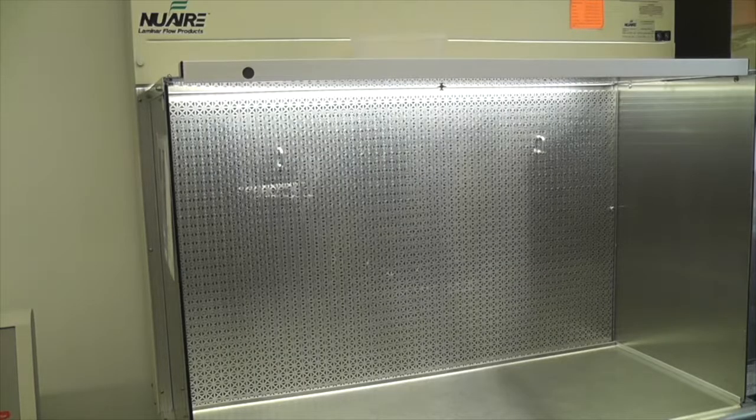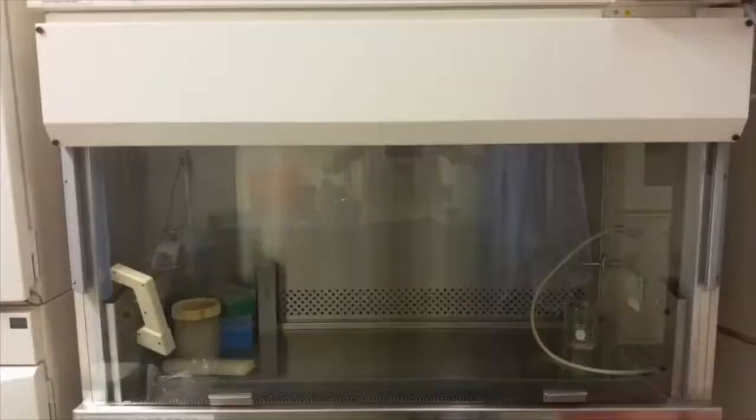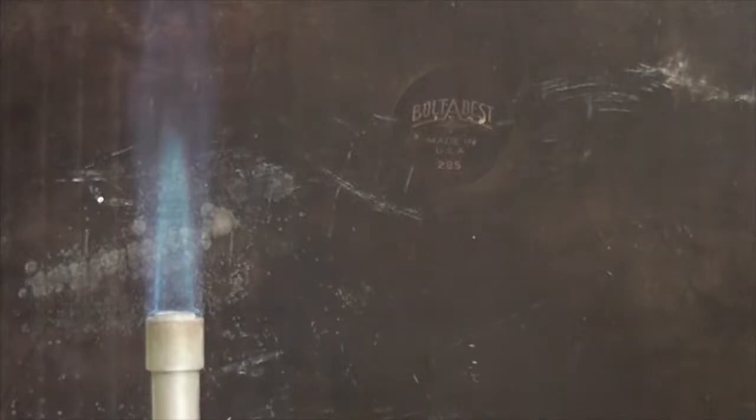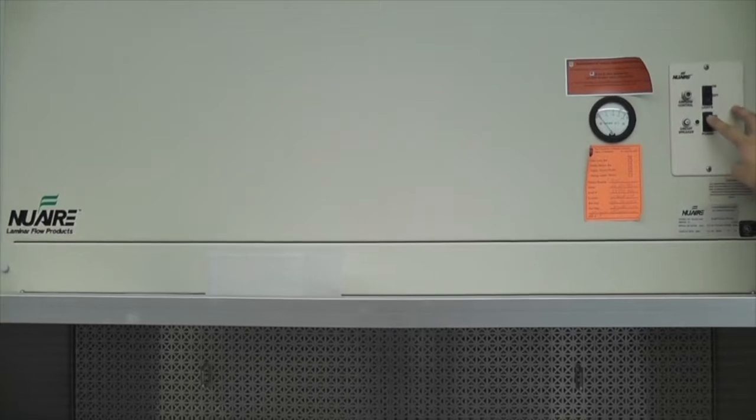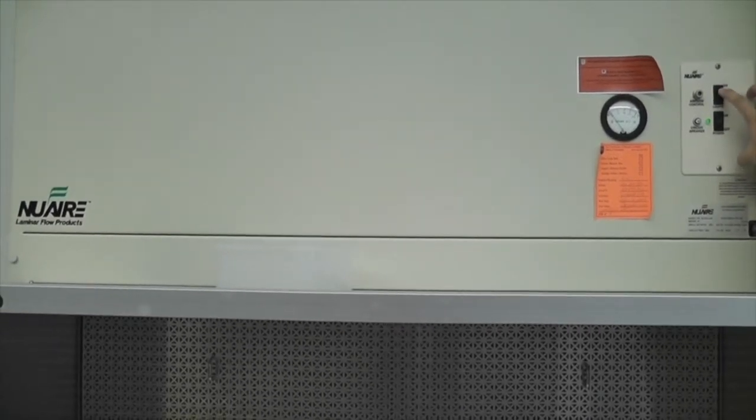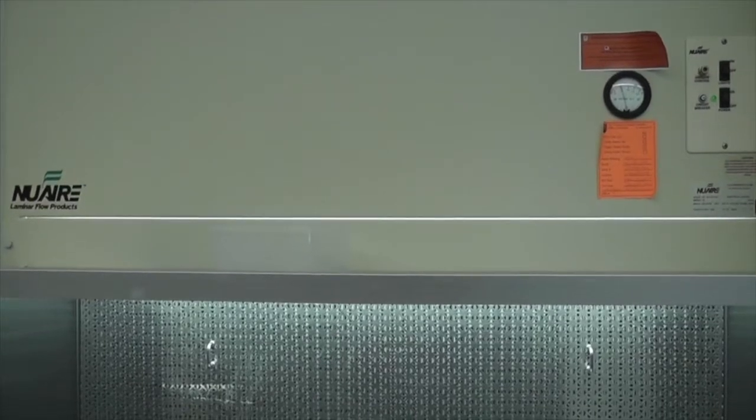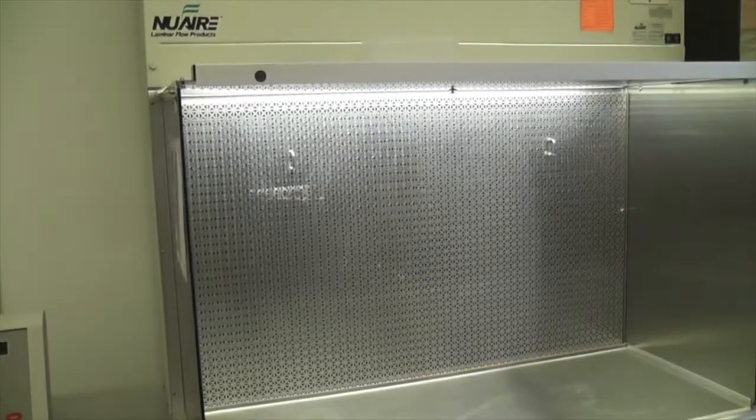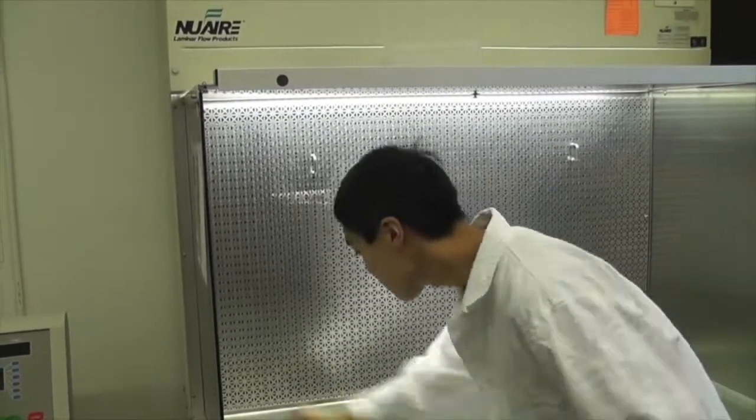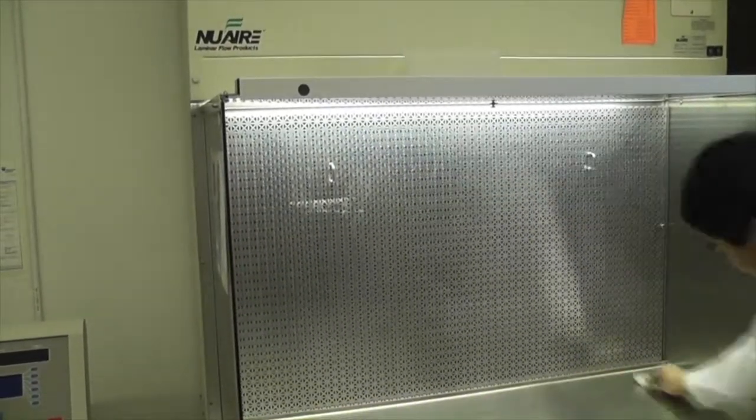Ideally, plates should be poured in a laminar flow hood or biological safety cabinet to ensure that they will not be contaminated with microorganisms from the environment. However, if one is not available, plates can also be poured within 6 to 8 inches of a flame using proper aseptic technique. Ensure the flow hood is switched on at least 15 minutes before use to establish laminar flow and remove airborne contaminants already present in the hood. Make sure your work area is thoroughly sterilized with 70% ethanol or another disinfectant.